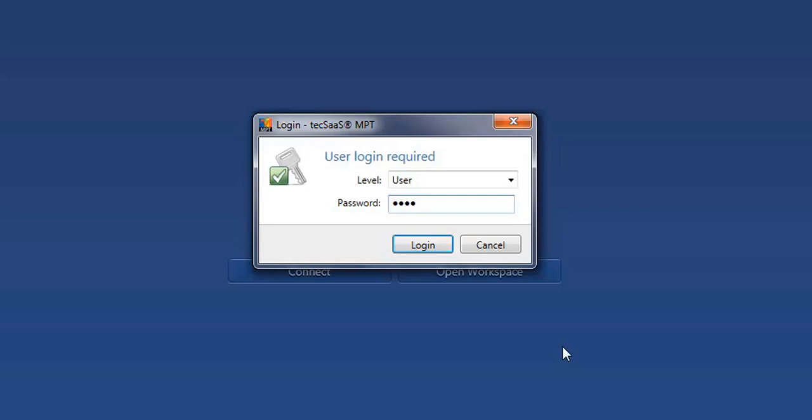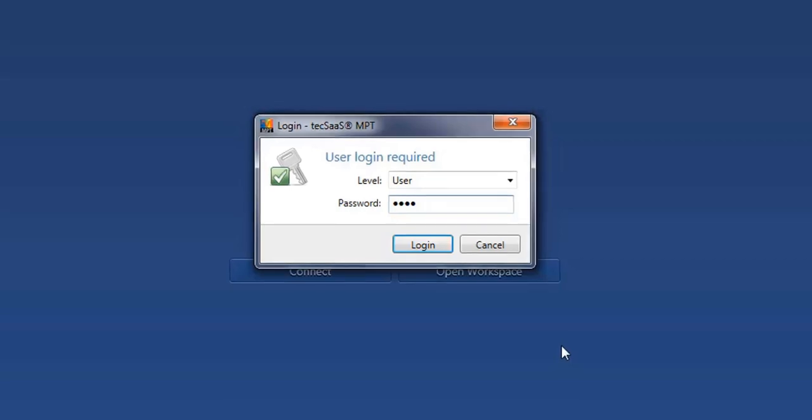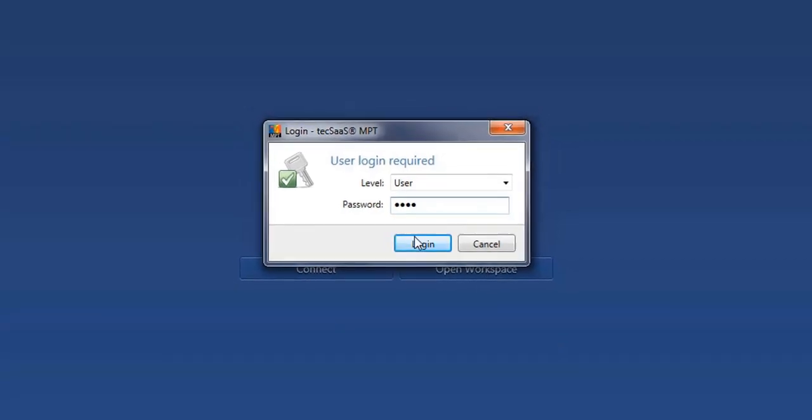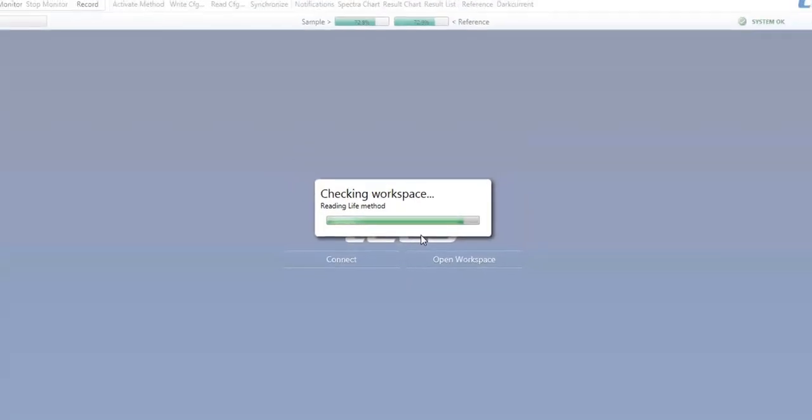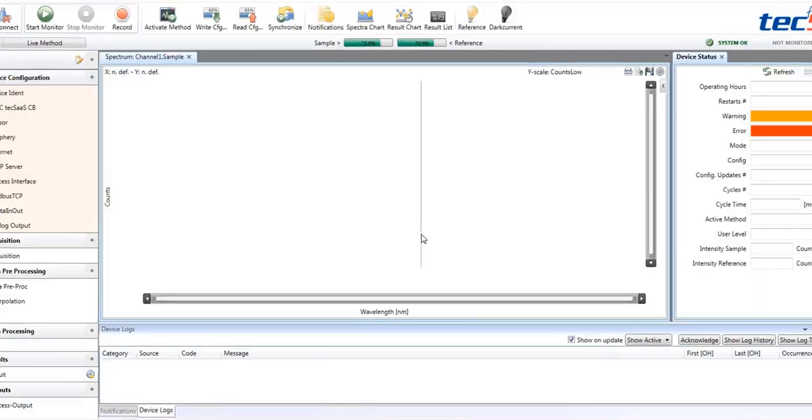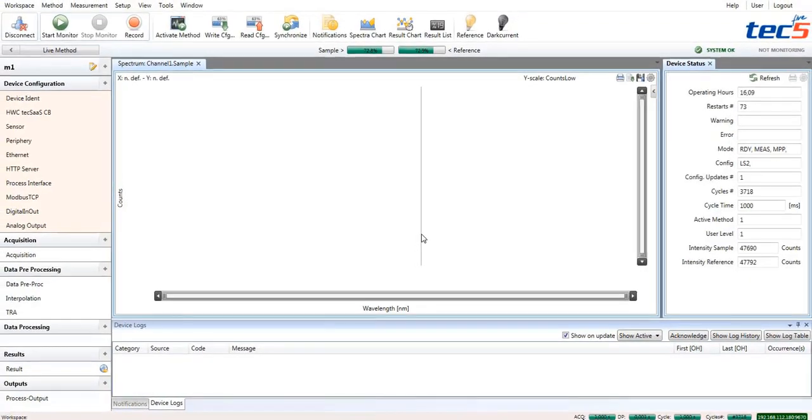Of course, the standard password can be changed to a user-defined password. As soon as login is completed, the relevant information is displayed in the top right corner.